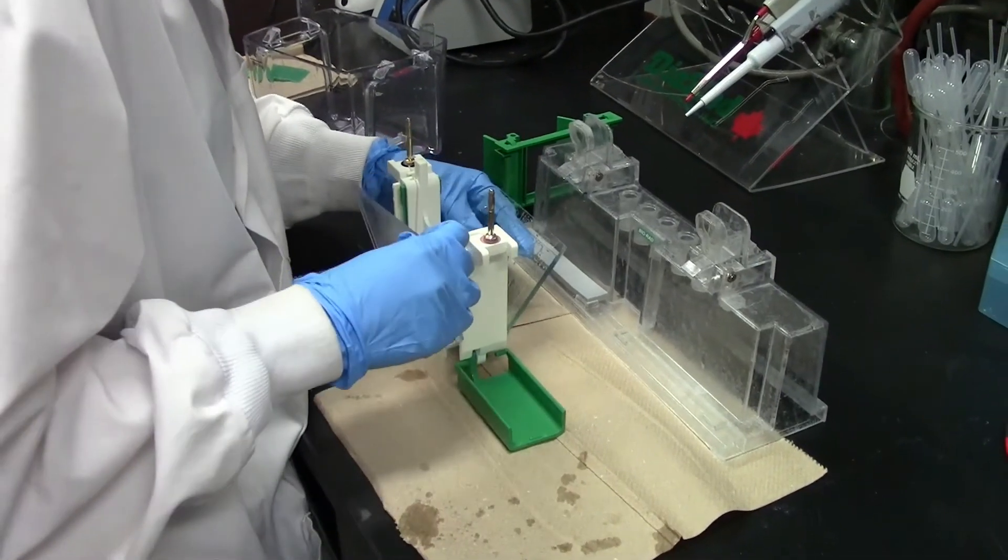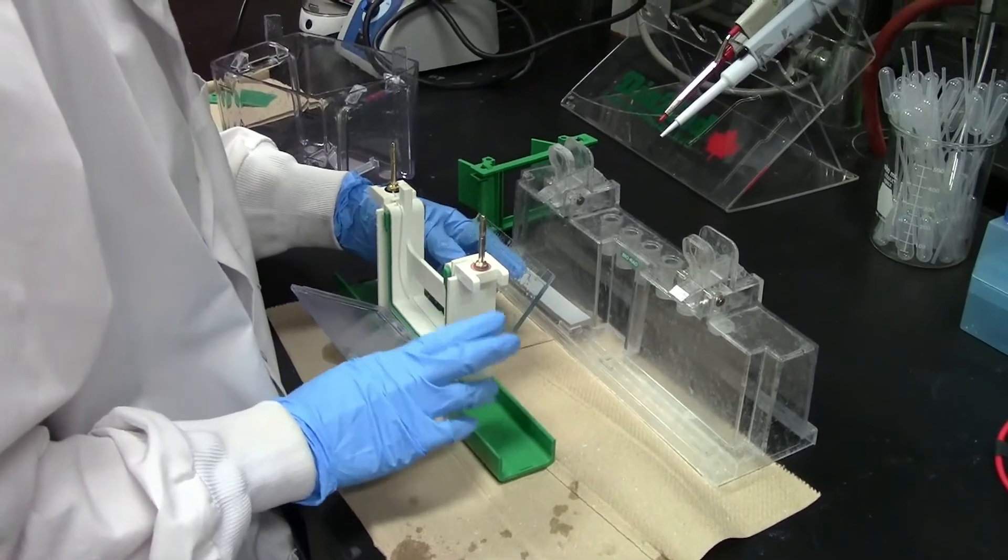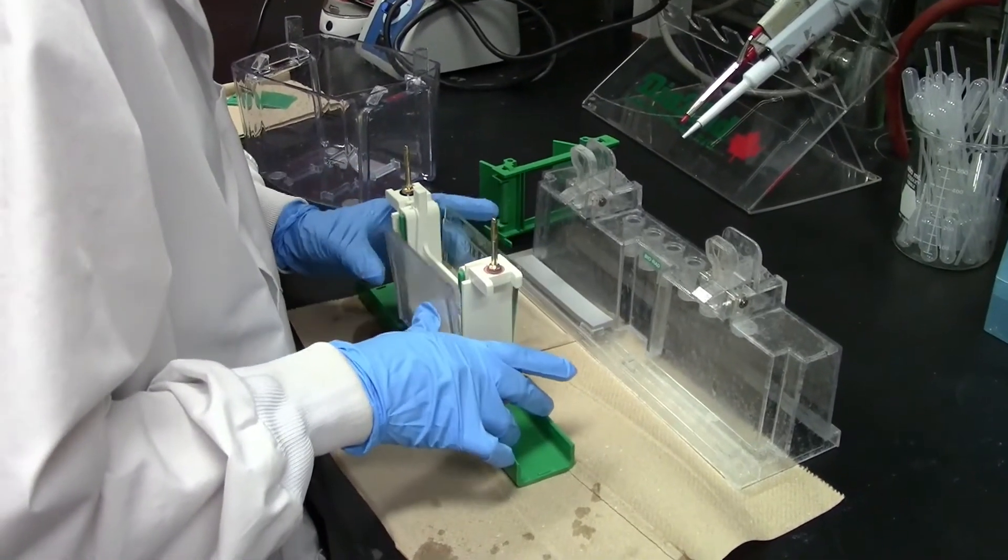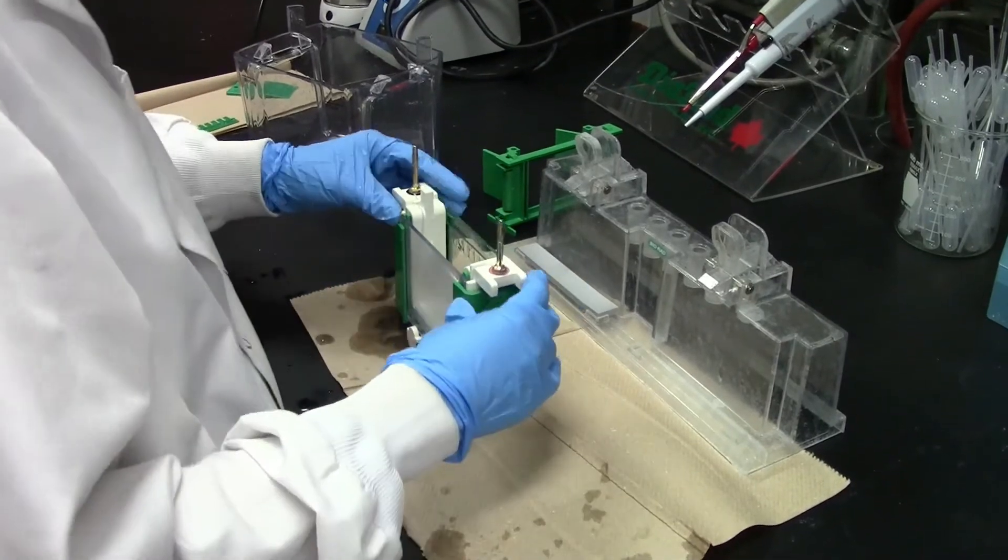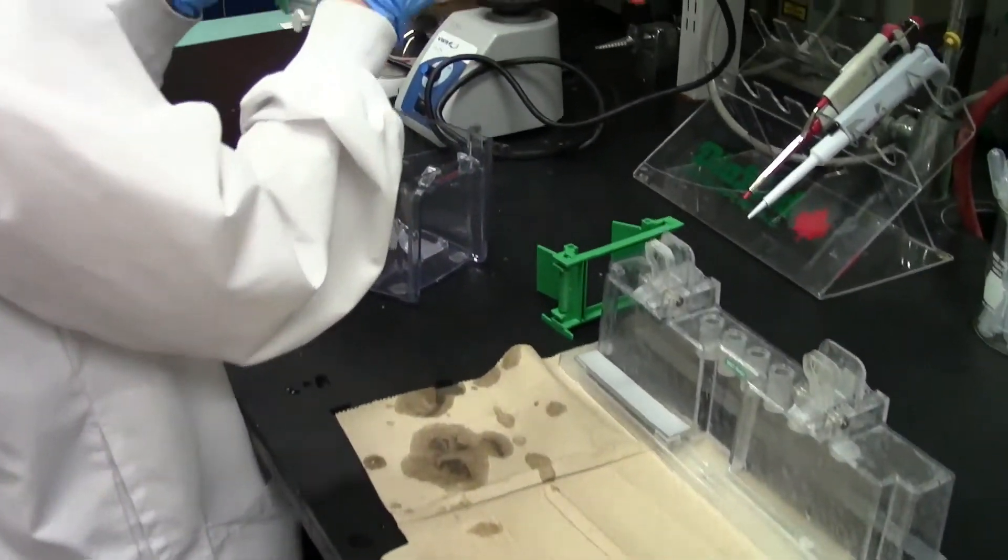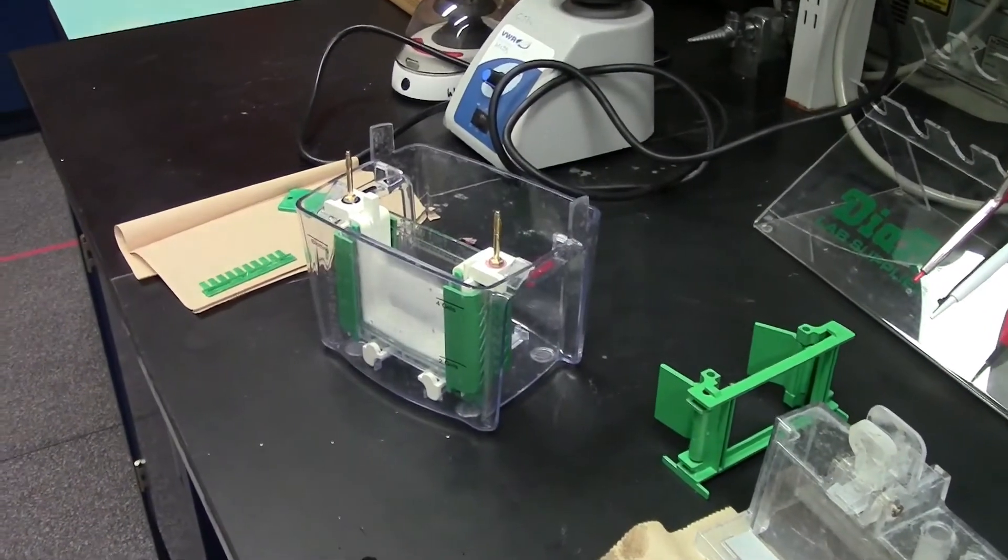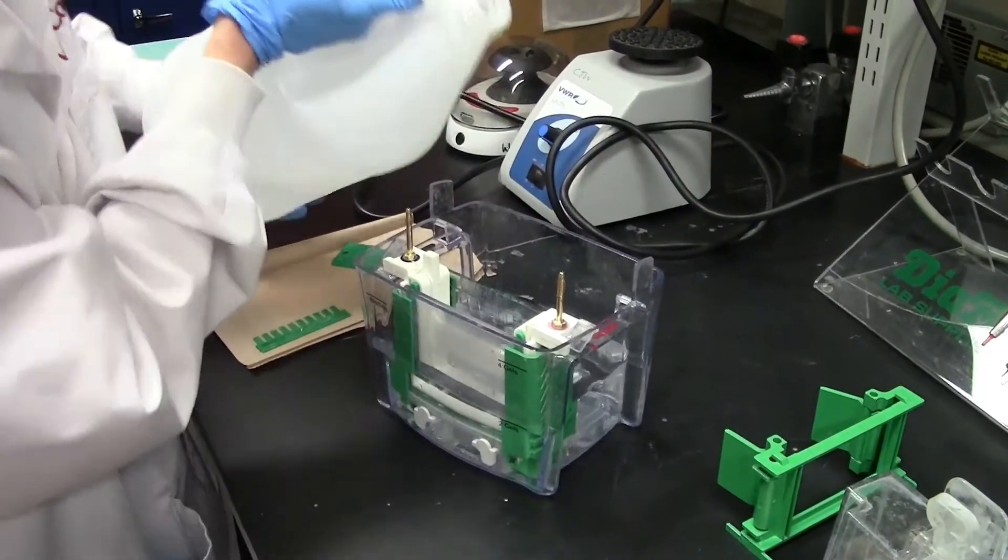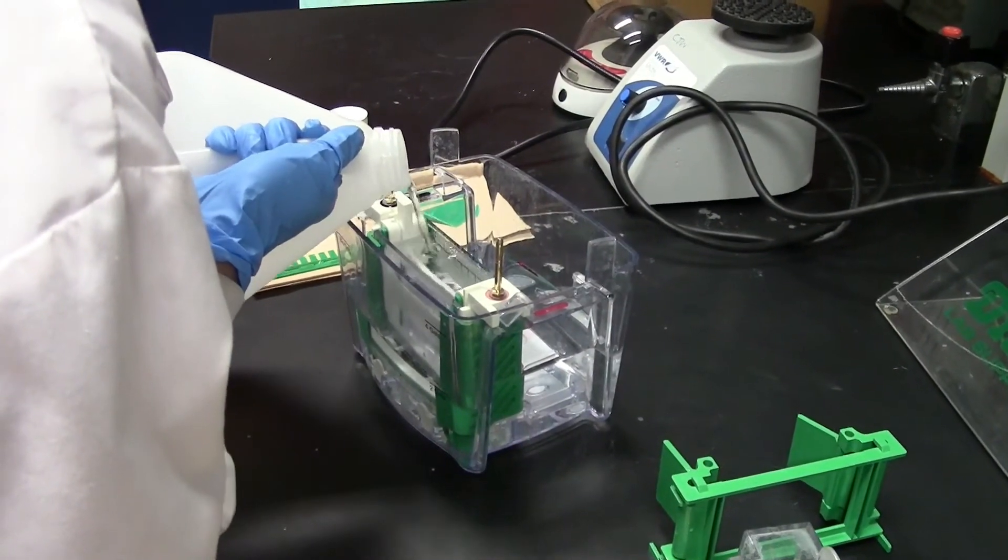For us, we use 1x TBE buffer. You will then need to place your gel in the electrode assembly with the short plate facing the inside, along with a second gel or a buffer dam if you are only running one gel. Place the electrode assembly in the buffer tank and fill the buffer tank with recycled 1x TBE buffer up to the line labeled 2 gels. And lastly, gently fill the space between the plates with fresh 1x TBE buffer.